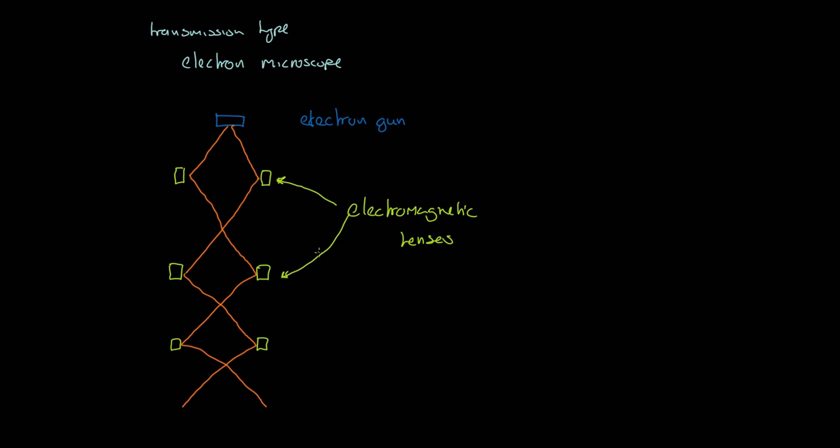You might just want to get a feeling for the fact that electrons are negatively charged. So with these electromagnetic lenses, the electrons are being attracted into that area and then being reflected and diverted off by another one. But what happens here is we actually take our specimen, that was meant to be red, and our specimen is here.